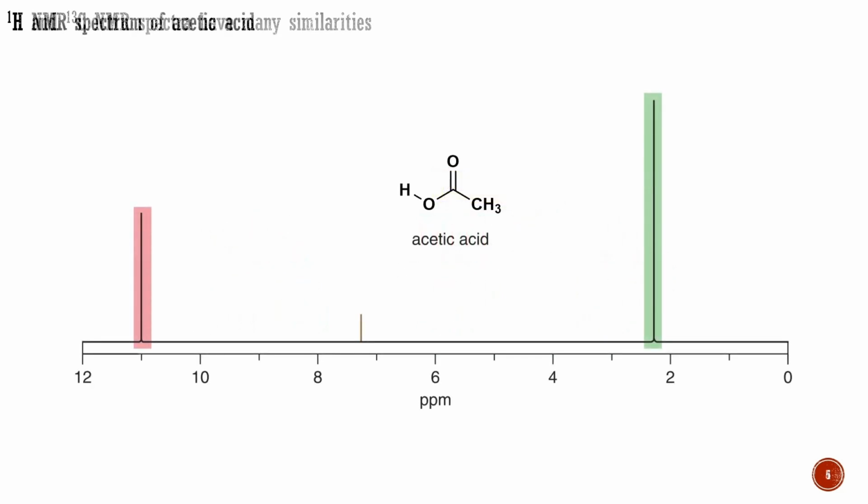Here's the proton NMR spectrum of acetic acid, which you first saw in the introductory module on structure determination of organic molecules. Proton and carbon NMR spectra have many similarities. The scale runs from right to left, and the 0 point is given by the same reference compound, although it is the proton resonance of tetramethylsilane rather than the carbon resonance that defines the 0 point here. You will notice at once that the scale is much smaller, ranging over only about 12 ppm instead of the 200 ppm needed for carbon.